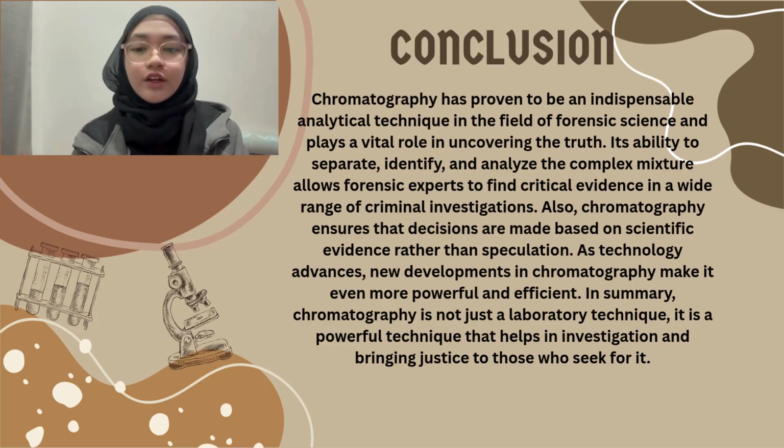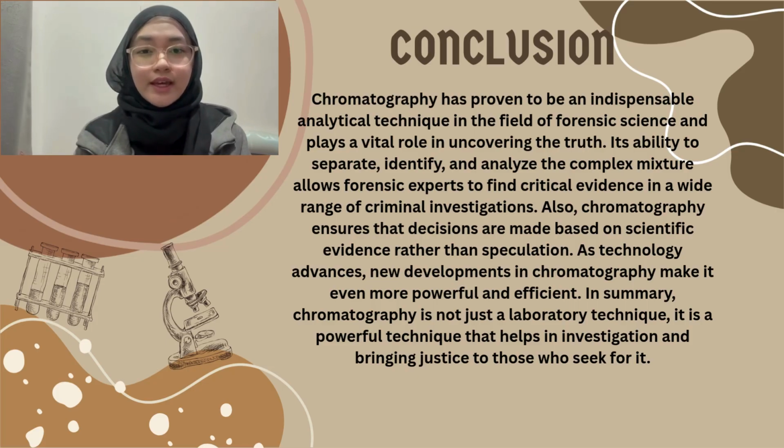In conclusion, chromatography has proven to be an indispensable analytical technique in the field of forensic science and plays a vital role in uncovering the truth. Its ability to separate, identify, and analyze complex mixtures allows forensic experts to find critical evidence in a wide range of criminal investigations. Also, chromatography ensures that decisions are made based on scientific evidence rather than speculation.